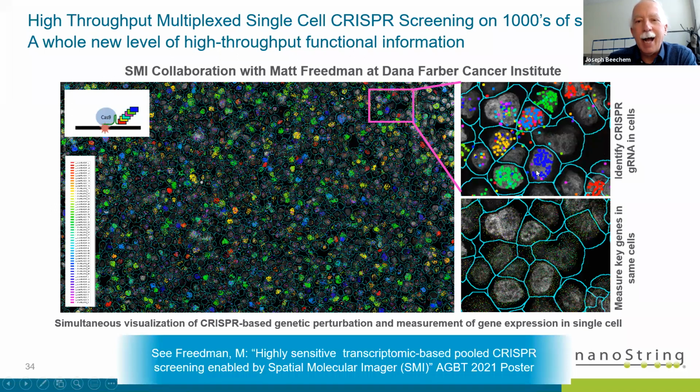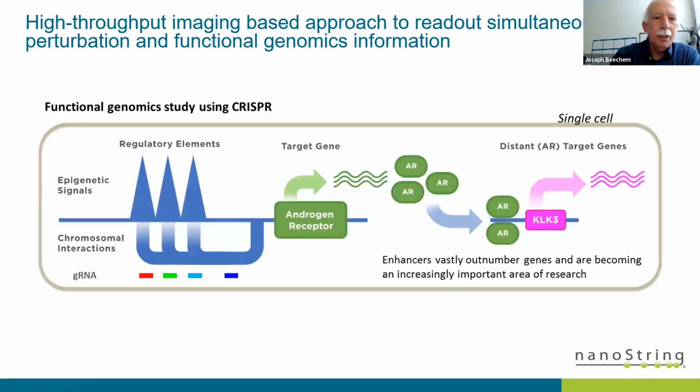So if you look at the guide RNAs, just look at the panel right underneath there, that'd be the 1,000 plex phenotypic readout of the change in those 1,000 genes that are related to the operations, the active operations doing at the guide RNA level.